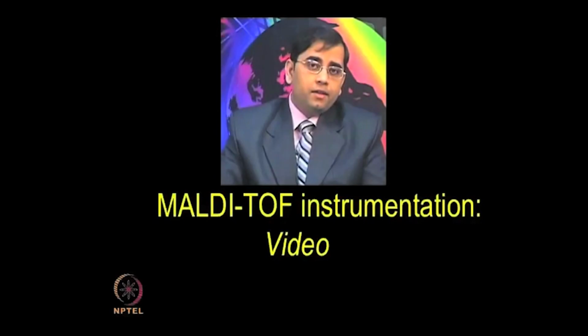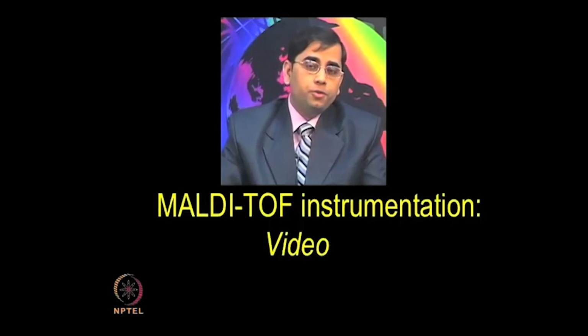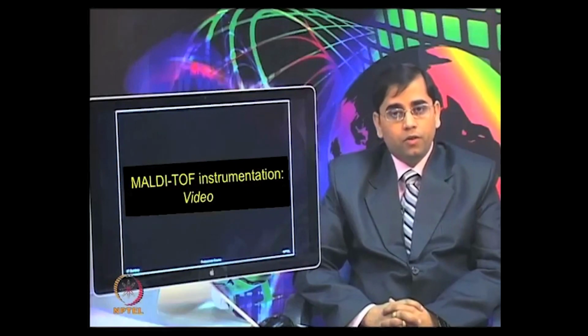After spotting is done and the MALDI plate is dried for almost 30 minutes, the instrument can be turned on and MS analysis can be performed. Now, there are various types of configurations of these instruments available, as well as various types of commercial software which help to operate the hardware. It is not possible to go into individual detail, but I am going to show you the generic steps in the following video of MALDI-TOF instrumentation.